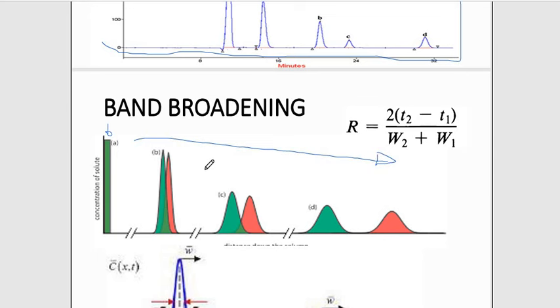Now with this, let's say I have a normal phase HPLC system. When they move down the column, the one which moved very fast will have less affinity, or is going to be less polar, compared to the one which moved slowly down the column. So these bands or peaks, as they move here, appear very narrow, but when they move down, they tend to expand.